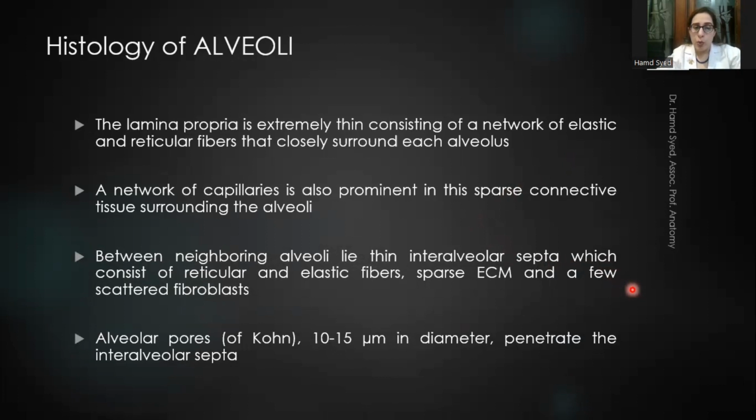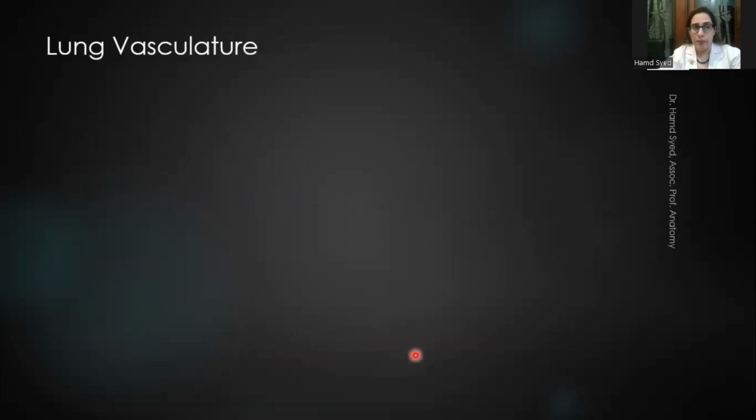Also, the alveolar pores are the connections or communications between the adjacent alveoli, which are 10 to 15 microns in diameter. They penetrate the interalveolar septa.